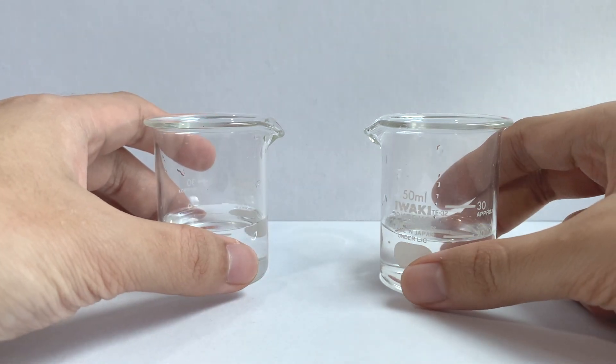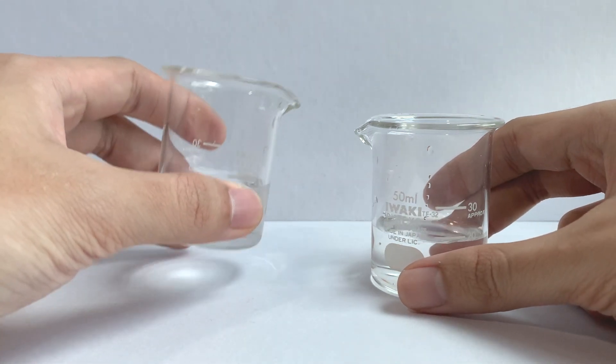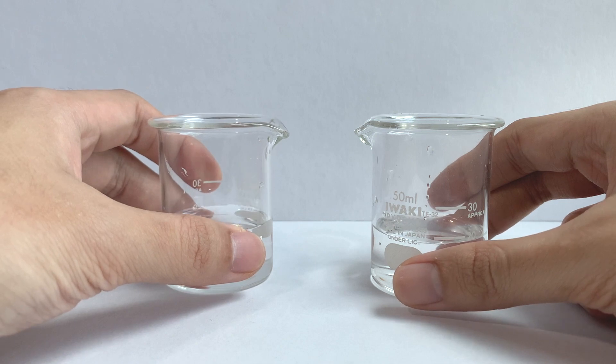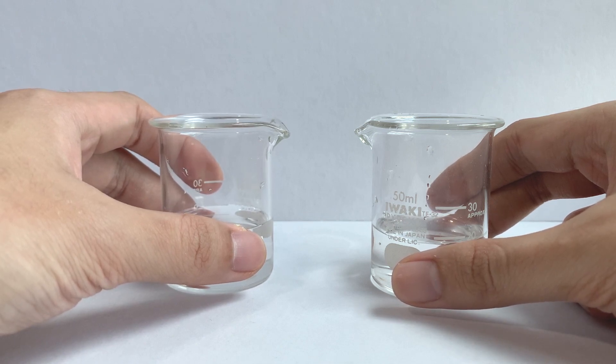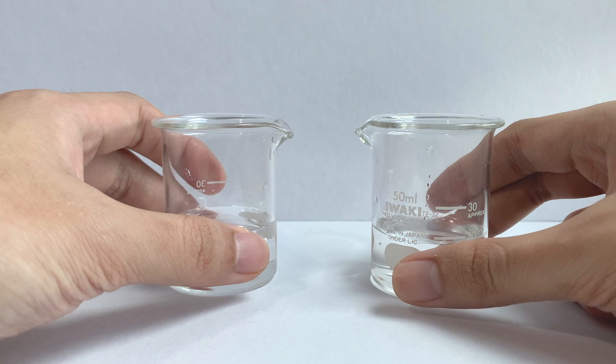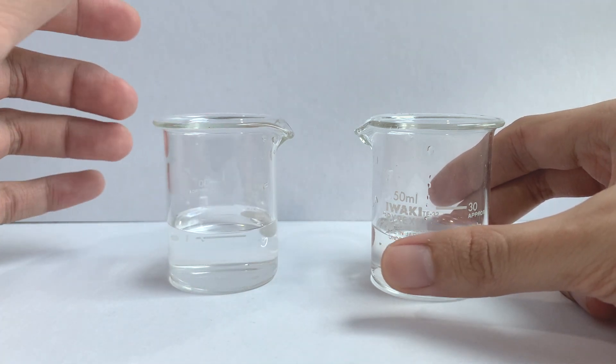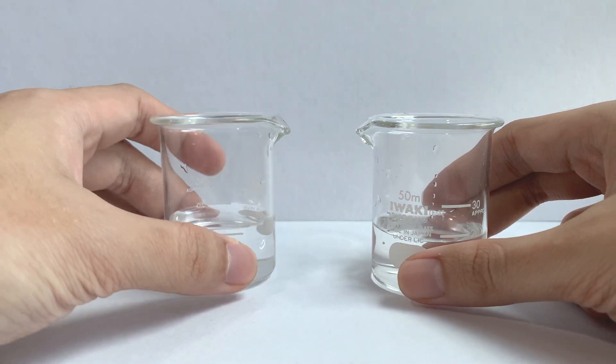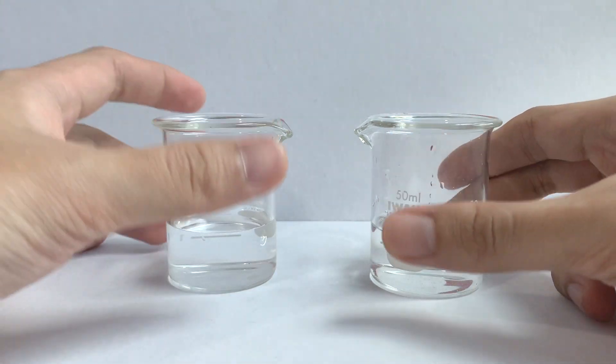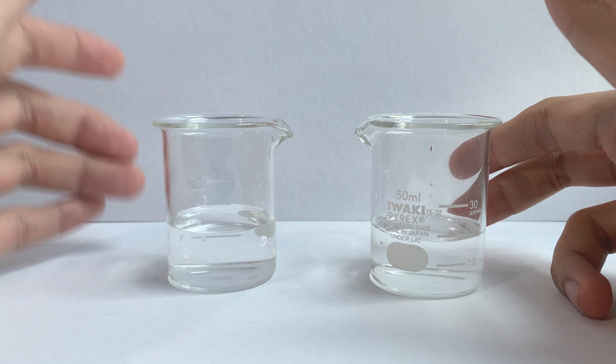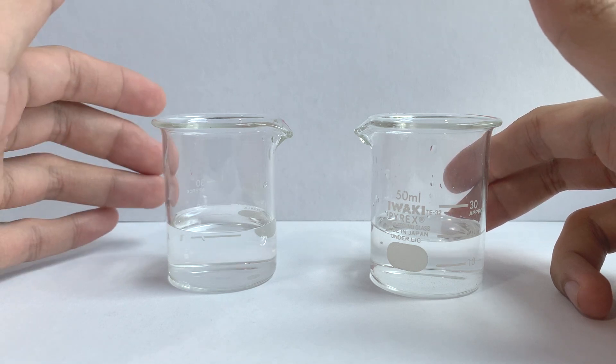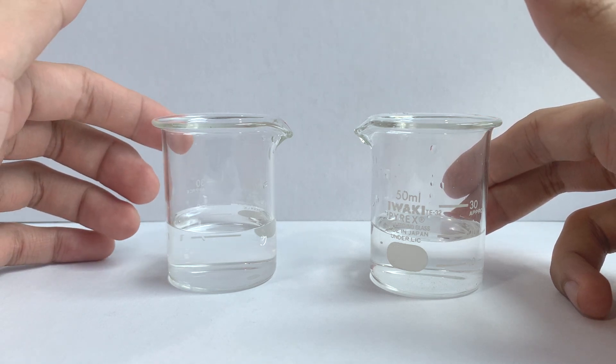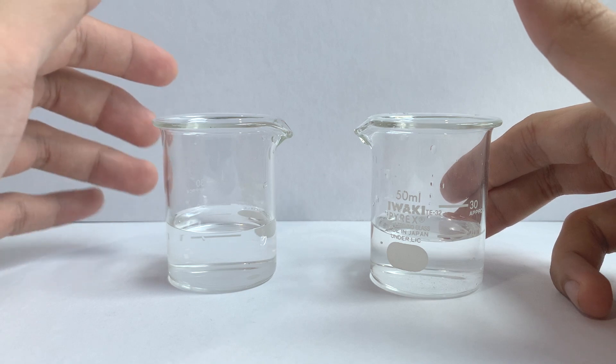The second problem is if I were to add the acid to the alkali and I have added an excess of acid, then my salt will not be pure anymore because there will be an excess of one reagent. In order for this salt to be pure, we must add the exact amount of acid and alkali so that complete neutralization happens. We cannot have an excess of any one of them.